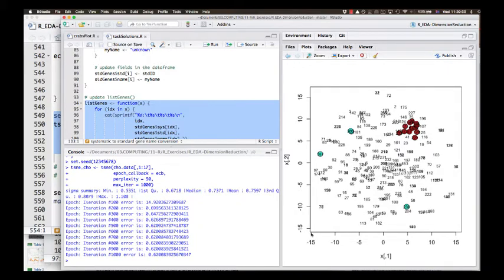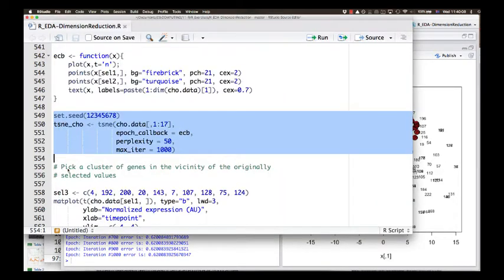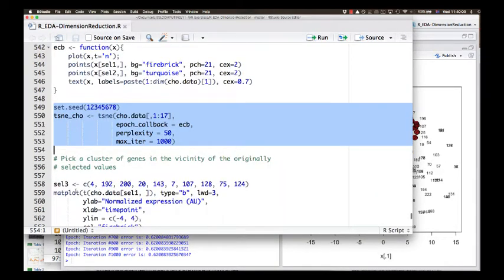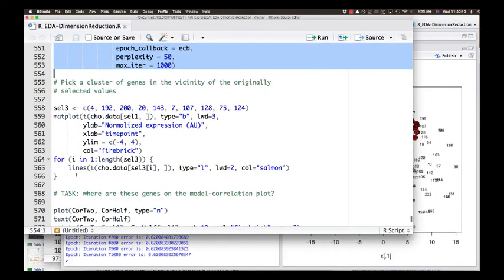After a thousand iterations, we come up with this result. The negative correlations weren't well preserved, but the positive correlations are very well clustered. So we can ask: what do genes in the vicinity of the original selected values look like?